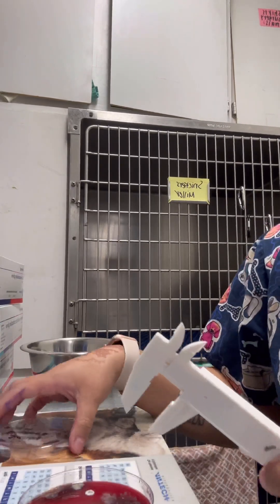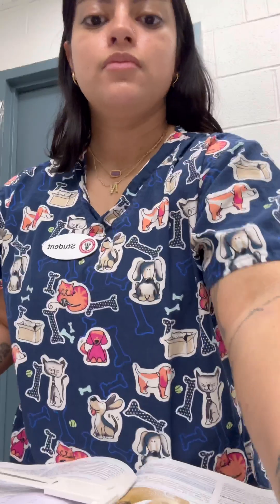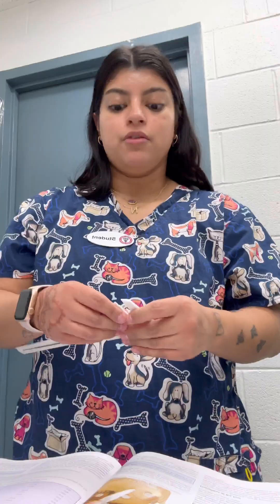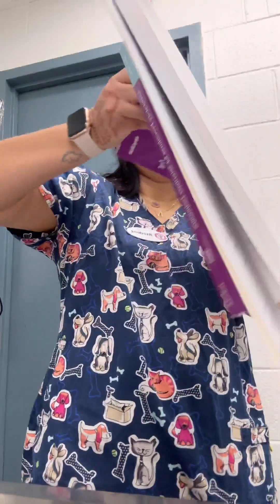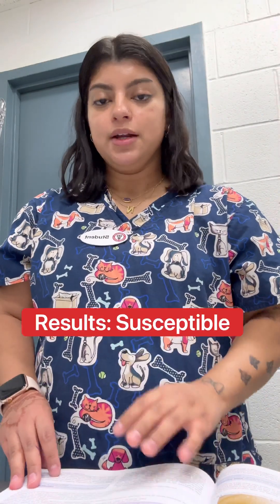Now that I have those measurements, I'm going to write my results onto my chart. We measured the complete width of the sample around the antibiotic disc. The measurements that we got for the two samples that had growth on them were 18 millimeters and 24 millimeters. I compared that with the chart in my textbook, and I can see that my results were susceptible to this antibiotic.